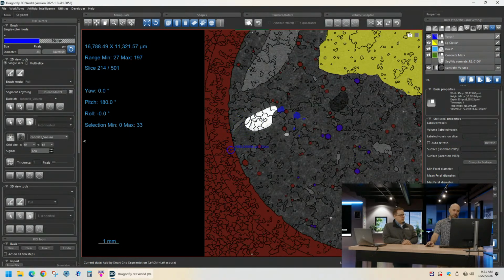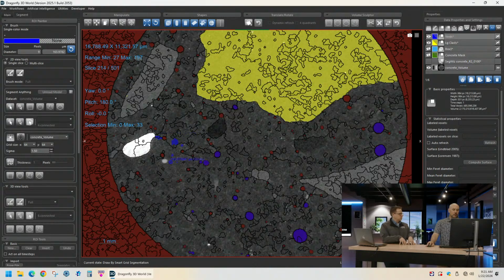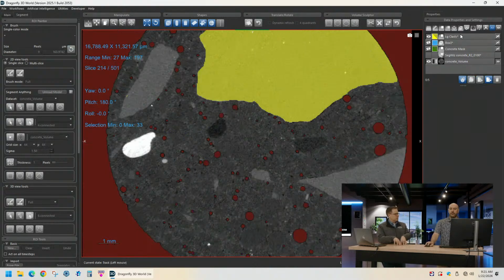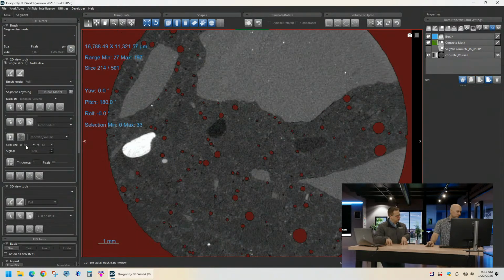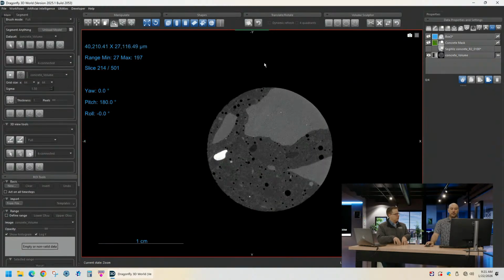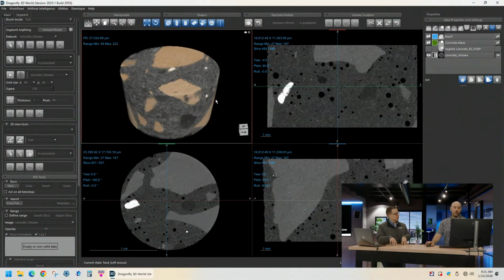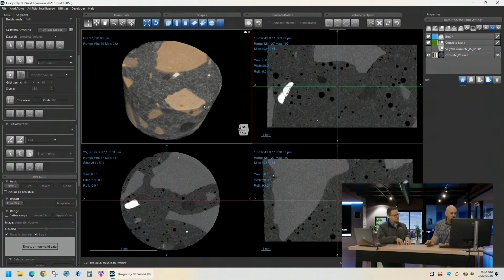Right. Yeah. All right. So now this was ratcheting it up. We started with the histogram, segmenting. Then we went up to the painting, and we just did painting by ourselves. Then we did painting with a grid. Yeah. And now you just showed us how you could swap. Like, you could use the histogram tool as a guide, but then change the colors back and forth. Right. And then we did segment anything. Right. And that's pretty cool because basically you could take any sample in there, and if you can visually see it, generally it's pretty good.